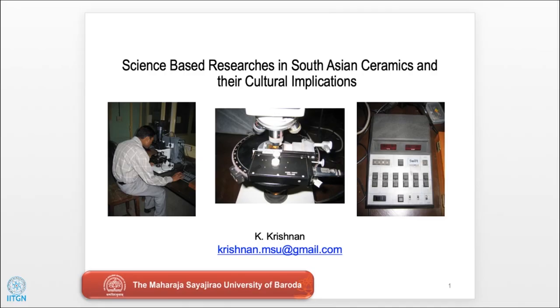Now what I've been doing as a characterization is that, either using mineralogical composition or chemical composition, I was trying to identify certain groups, and with the help of that group, I was trying to say this is the provenance or the genesis of the material. And once you know the provenance of the material, you see from which archaeological context, from which site, from which region these ceramics have come. So then you try to explain what was the mechanism of movement of the ceramics.